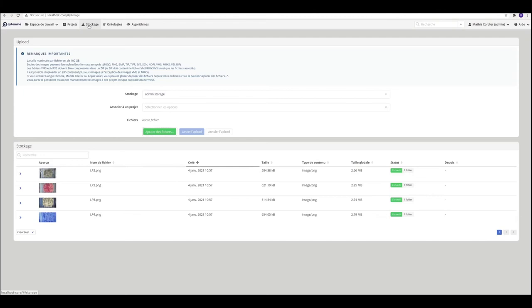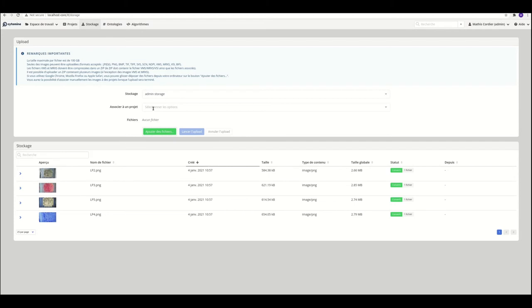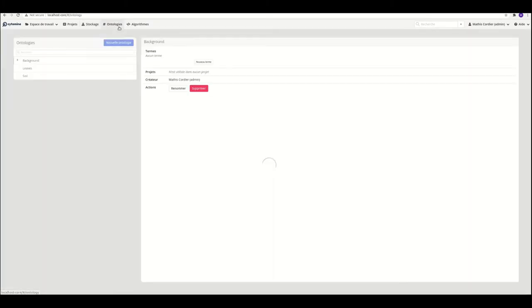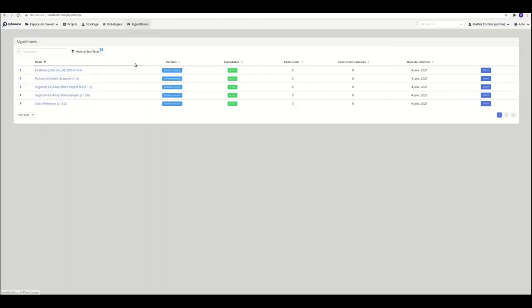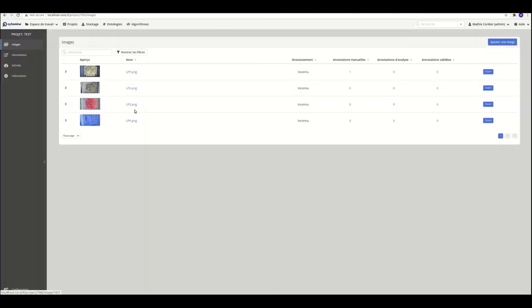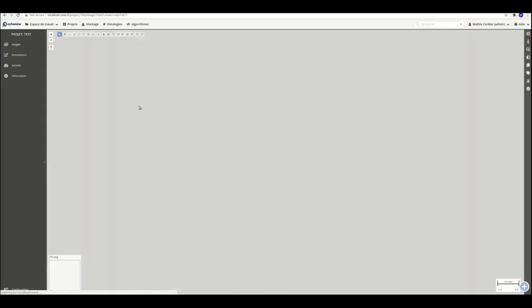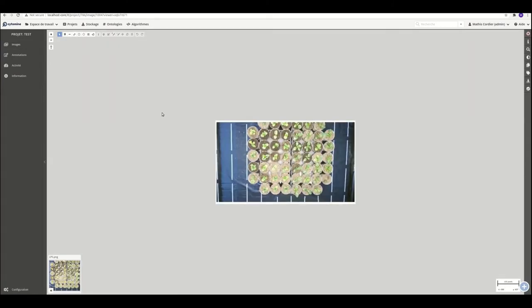So we can also show the storage folder. So here in the storage folder, we have the four images of the project test. In ontologies, you also have some tags which I added previously. So we have background, leaves, and soil. It's the same labels as Label.me and also the same images. So you have some algorithms provided by default by Cytomine to treat your images. So on LP5, you already have one image annotated.